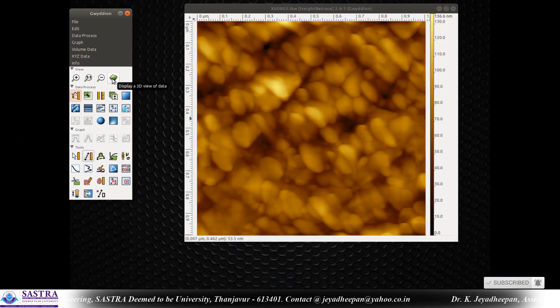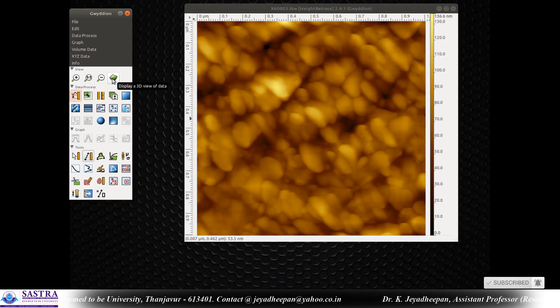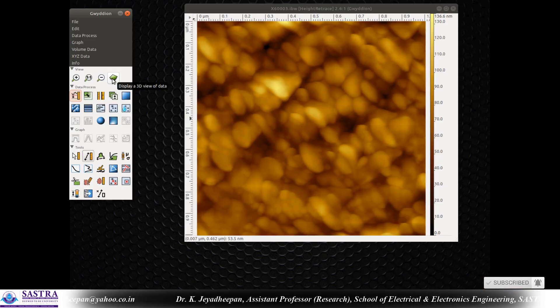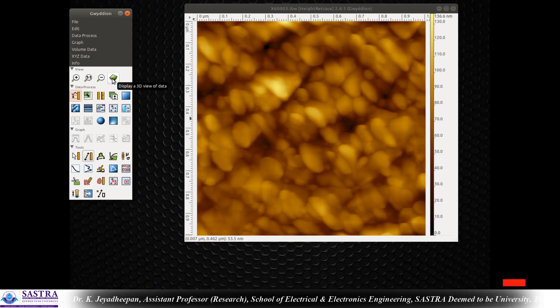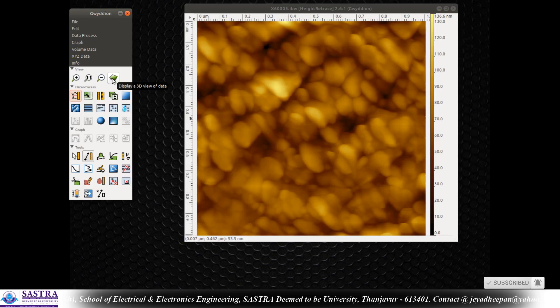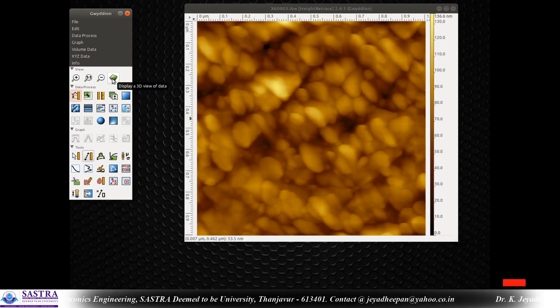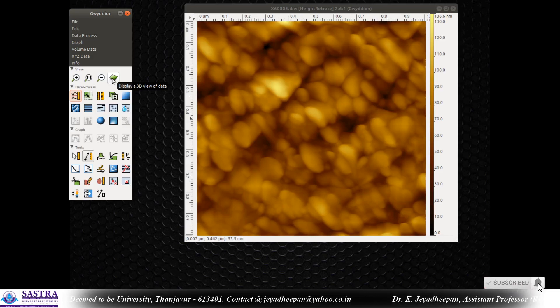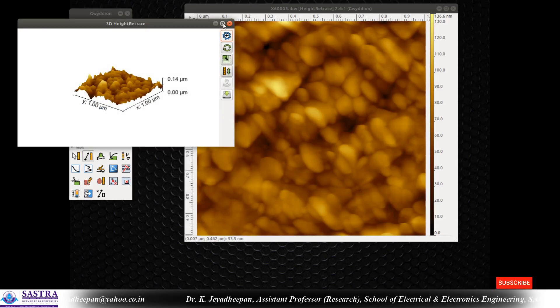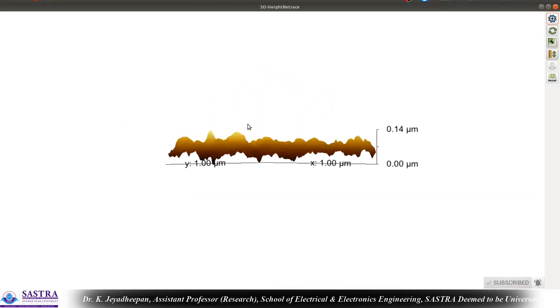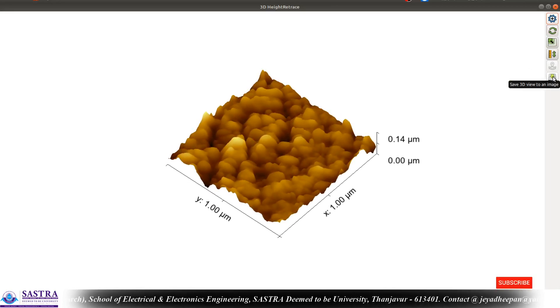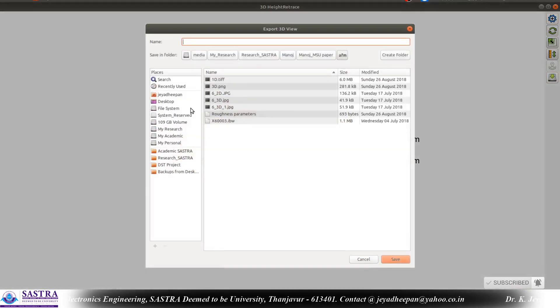Many other processes are available in this software but they are not allowable for publication because they would constitute data manipulation. What we have done so far is what is appropriate for AFM data. If you want to see the image in 3D view, simply press 'display a 3D view of data.' You can play around with the image as needed and save it using the save button there.